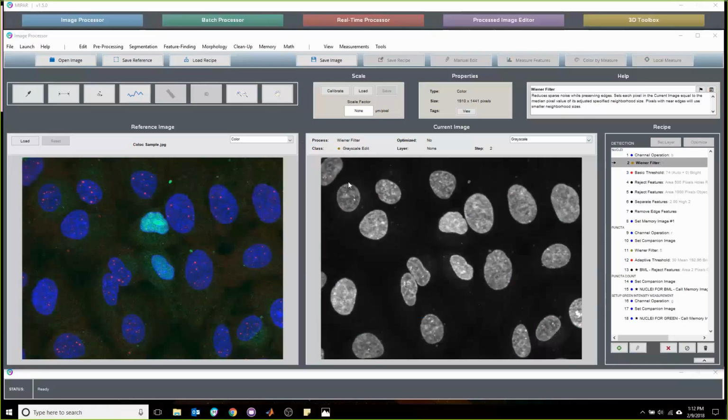Like I demonstrated during the material science section on the simple particle case, we had a couple of ways to approach that problem. We either could have just used an auto threshold bright to automatically set a threshold value to choose bright features. We elected to go with a smart cluster, which is really an auto multi-level threshold. So with a smart cluster of 3, you will automatically divide the image into 3 different classes, which can often be more robust than just choosing auto 2 classes. The trouble with auto 2 classes is that sometimes other gradients in the image can affect what the software decides.